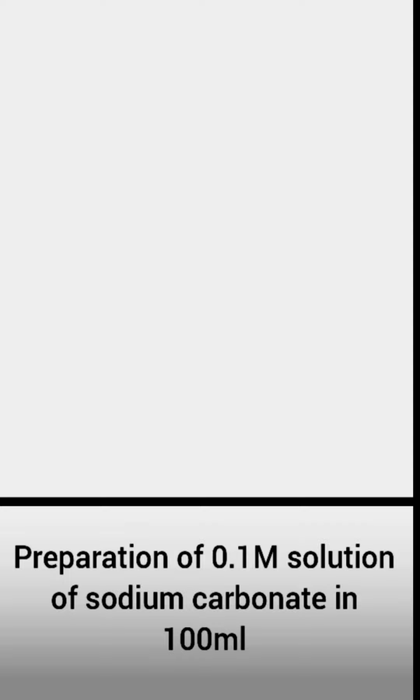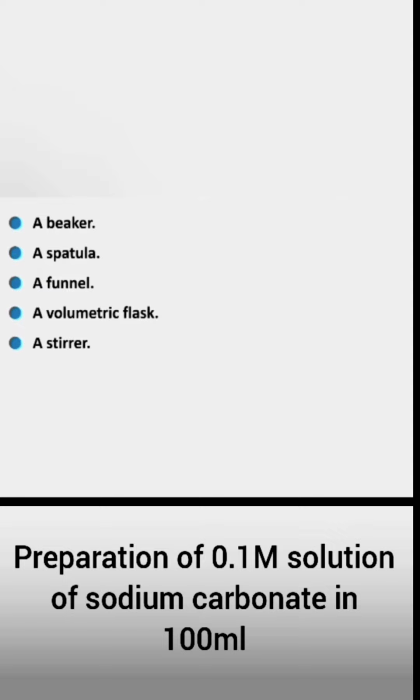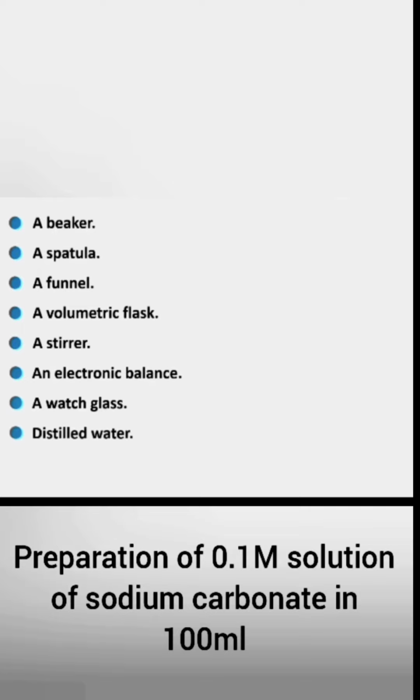In this practical, we require a beaker, a spatula, a funnel, a volumetric flask, a stirrer, an electronic balance, a watch glass, distilled water, and solid sodium carbonate.